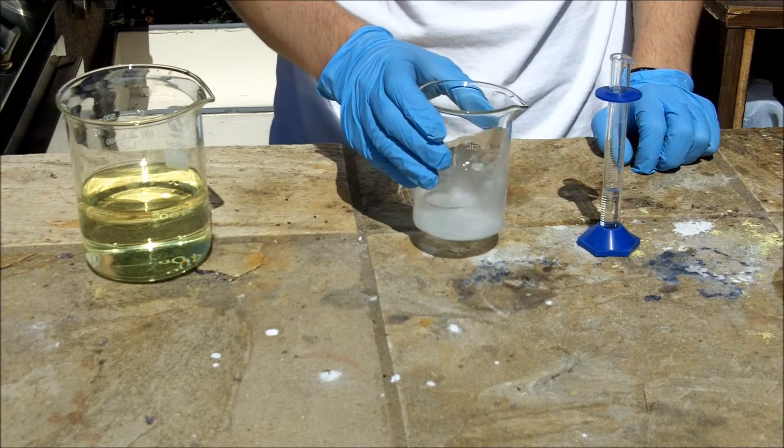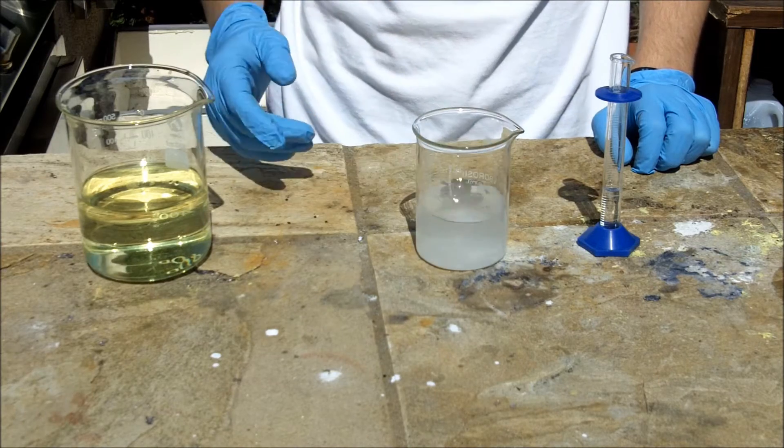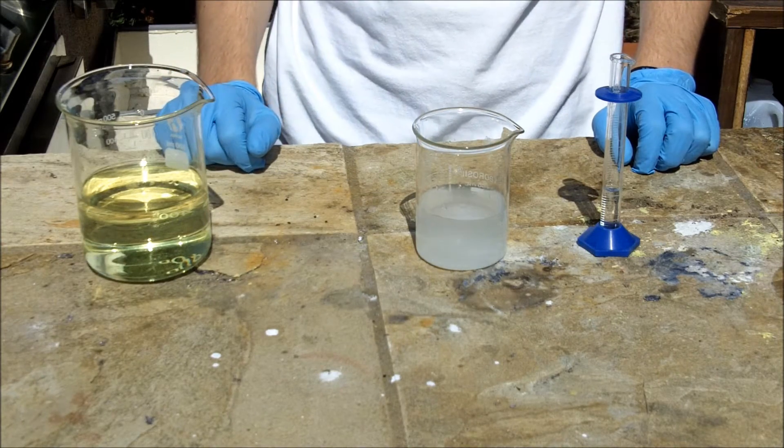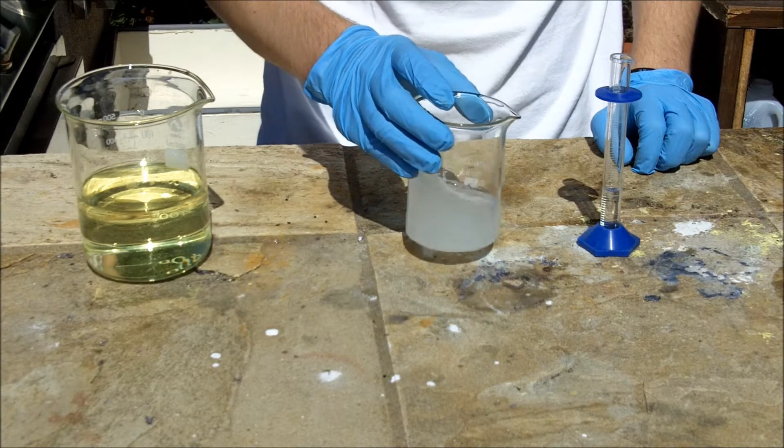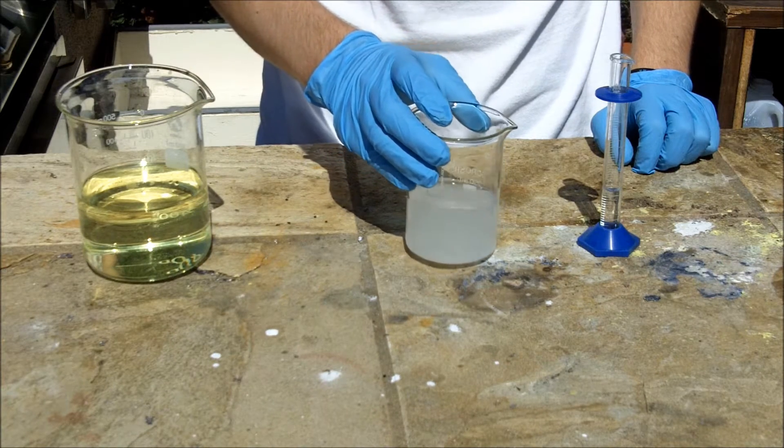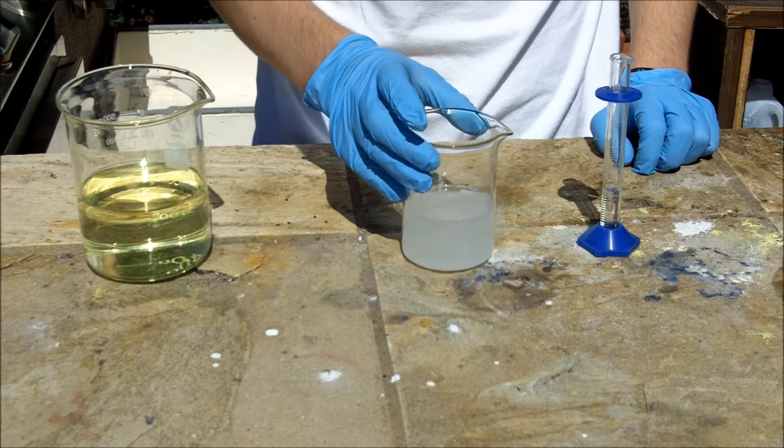I'll also be showing this method except using an iodide salt to make iodoform because I believe this is more forgiving of stoichiometry errors so it should be easier to get a higher yield than the method I showed in my iodoform video.